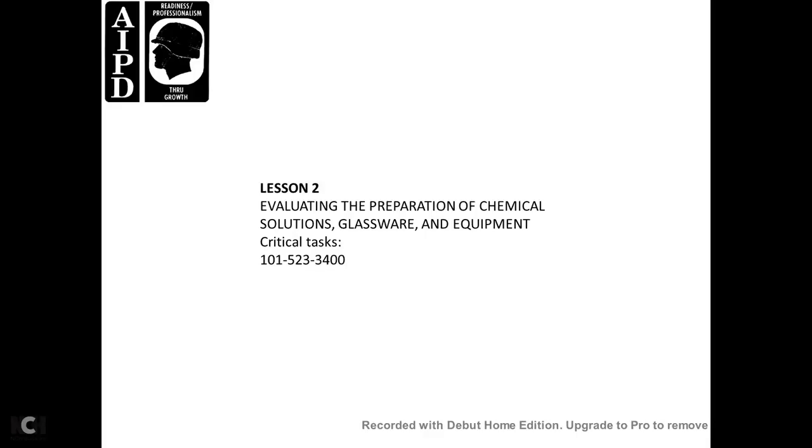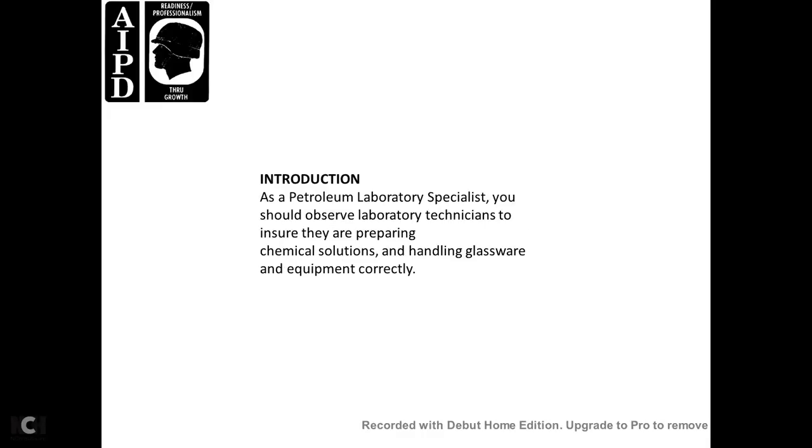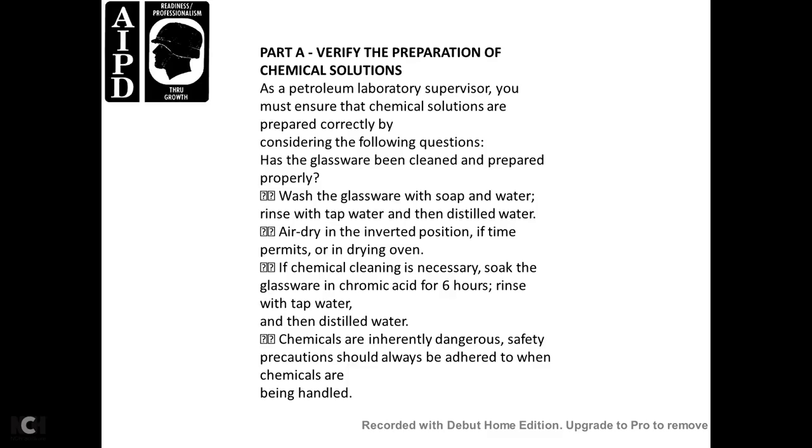Lesson 2, evaluating preparation of chemical solution, glassware, and equipment. Critical task 101-523-3400. Introduction. As a petroleum laboratory specialist, you should observe the laboratory technicians and ensure that they are preparing the chemical solution, handling glassware, and equipment correctly. Part A, verify the preparation of chemical solution. Laboratory supervisors, you must ensure chemical solution is prepared correctly by answering the following questions.